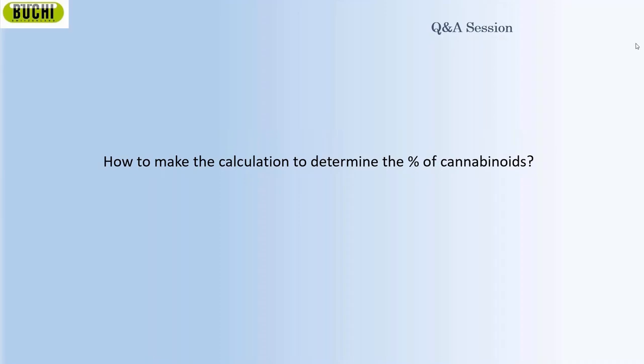Within 15 seconds with the NIR device, we can determine your CBD, THC, CBN, THCA, CBDA, whatever you calibrated, you can get these results. However, if we are talking about the amount of the cannabinoids after the separation, then your answer is the HPLC or GCMS. So if you go for the HPLC, you can analyze the amount of the cannabinoids in your oil.